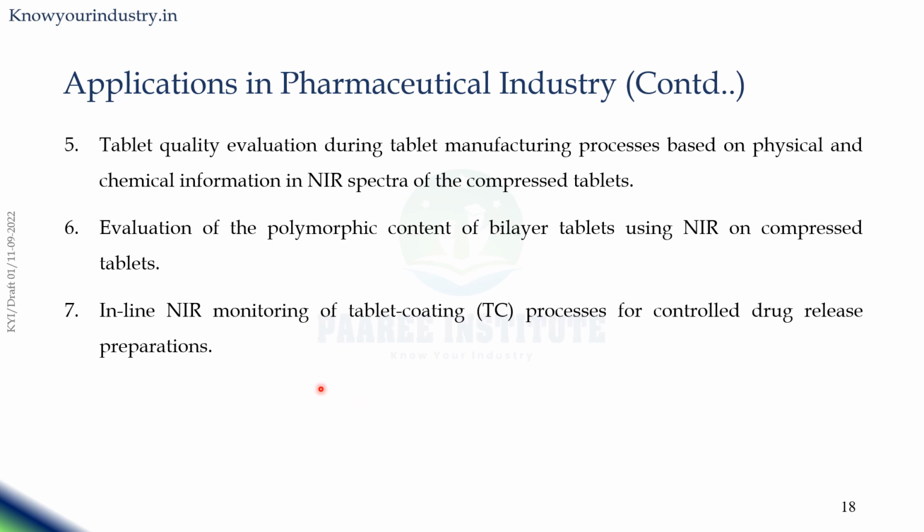Sometimes it is used to monitor the tablet coating process of controlled release formulations. And NIR spectrophotometers are generally handheld, so they are very effective and useful in the pharmaceutical industry.